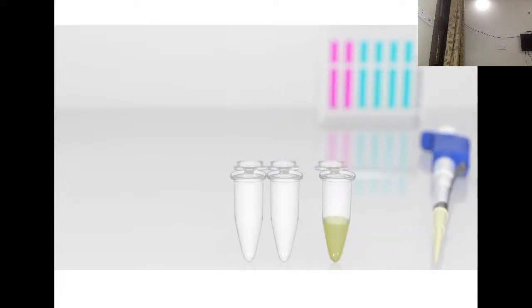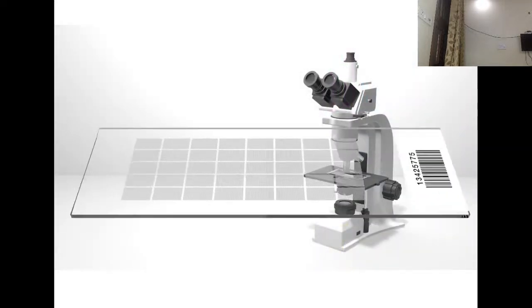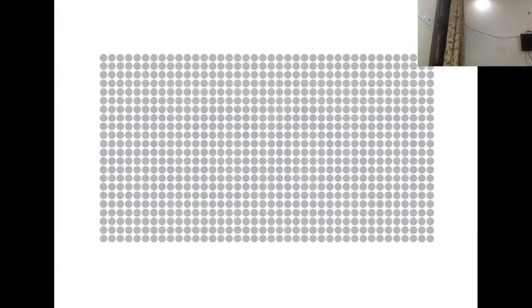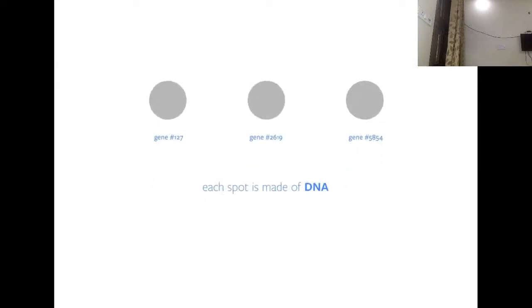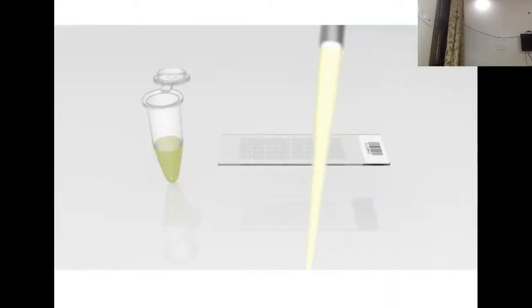At last, it's time to look at the DNA microarray. In our experiment, a microarray, or DNA chip, contains about 6,000 spots. Each spot is a different yeast coding sequence from a different gene. Let's choose three spots at random to follow in detail. Each spot is made of DNA that can base pair with its complementary cDNA. Here are partial sequences from each of the three spots we are observing. Now, let's incubate the mixed cDNA with the DNA chip.